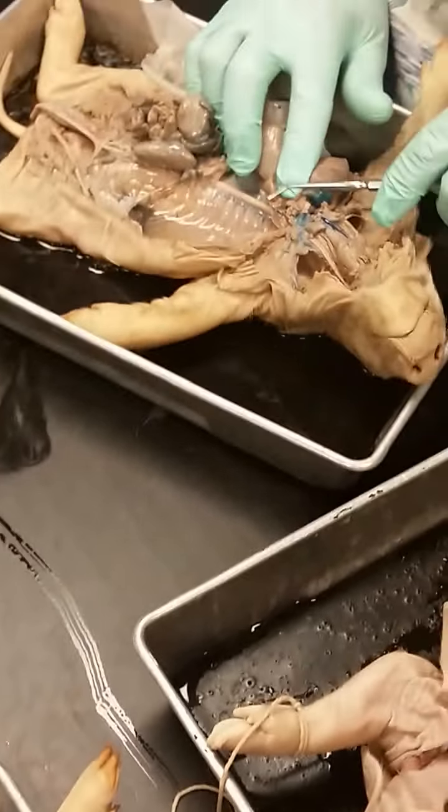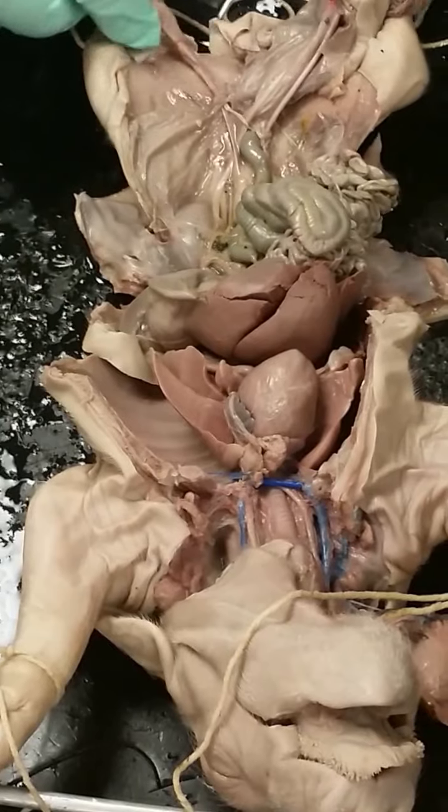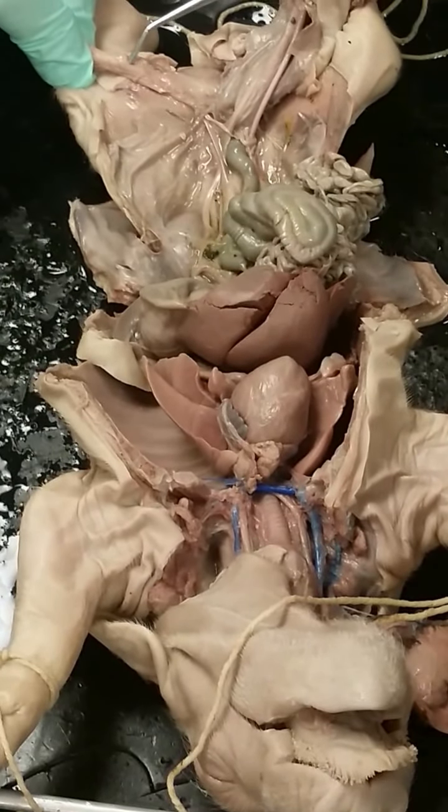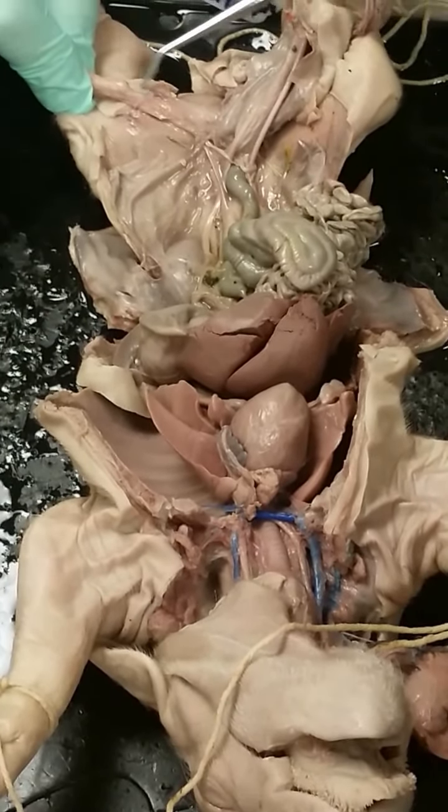Right there, if I stick the probe in there, that would be technically where the inguinal canal is. Right at the point where the testicular artery and the vas deferens are going to that one point. And then of course the testes, here's the testis, and then you see right along this lateral edge, this one for some reason doesn't look as good as some I've seen, but right there would be the epididymis. Okay?